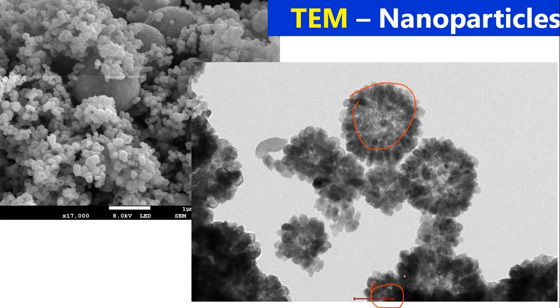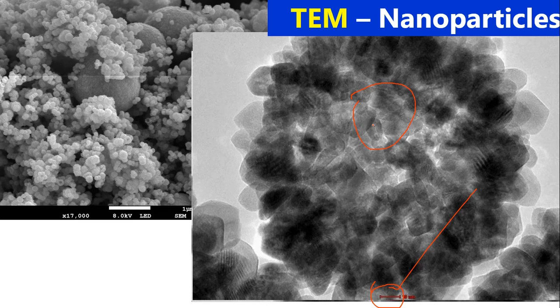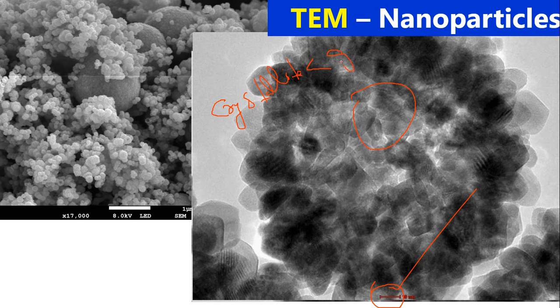At twenty nanometers, that big particle becomes visible. Zooming in further, the grains are now becoming visible. As explained previously, a crystallite is the smallest single crystal unit, then we have grains, and then particles. Here the grains are now getting visible — this is one grain here, and there is another grain here.